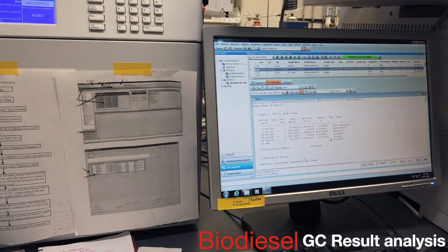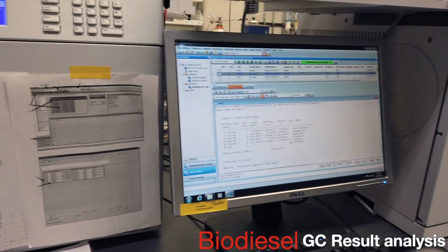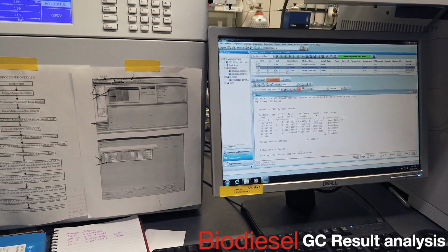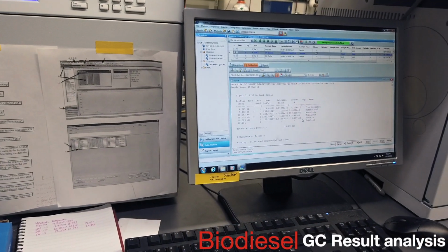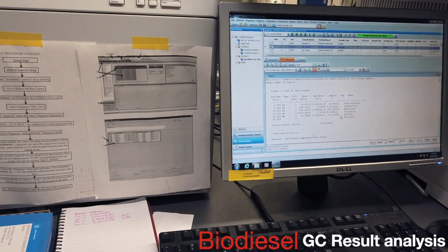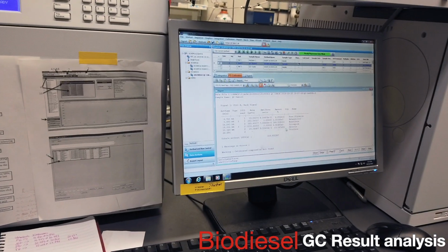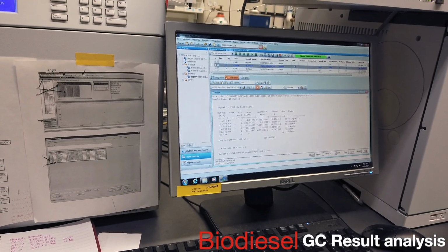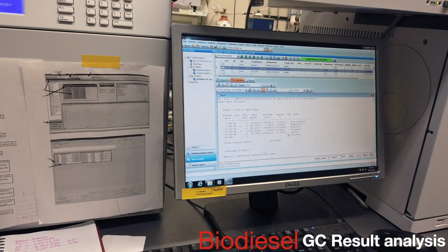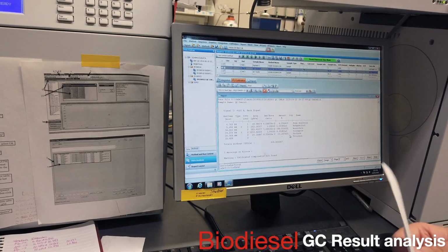I could never get that to work right, but if I took the areas and plugged them into an Excel spreadsheet where I can just put in the volume and the weights, it would calculate fine. So if you can figure out what the right units are to put in for this formula, that would be great, because the units that we were putting in never seemed to match up. Okay, I can mess with that.